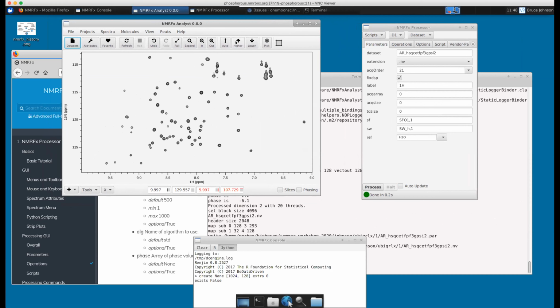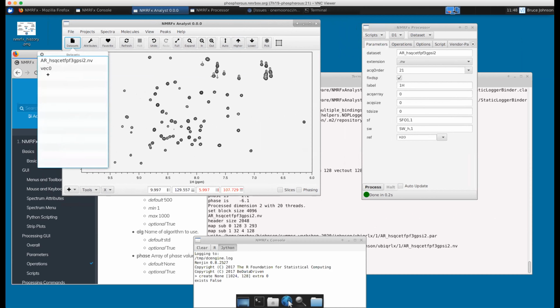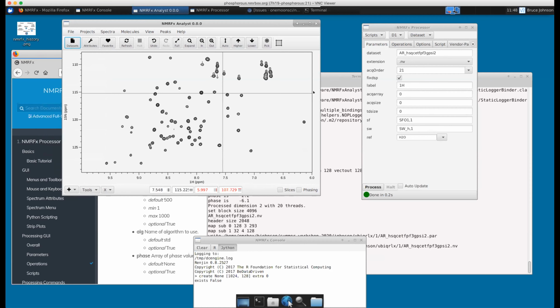Okay, so picking peaks. And let's also talk a little bit about the GUI here. I showed you once this data sets thing. If you click on it, it shows you all the open data sets, and you can just then drag data sets in here or into other windows. You can put multiple data sets on top of one another, or add these grids of windows.